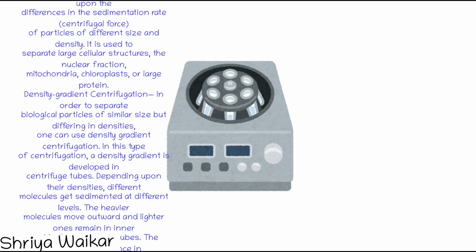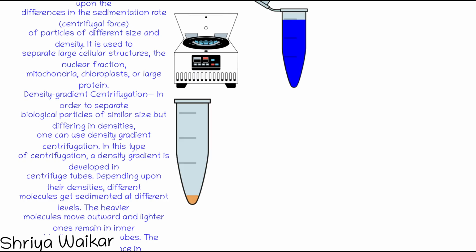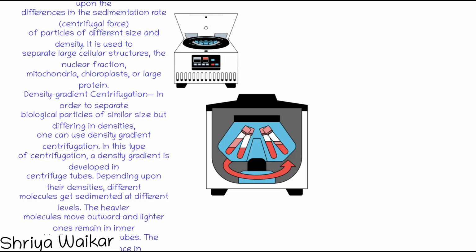Thus, what are the steps for centrifugation? Centrifugation is one such technique in which particles or molecules are separated based on density under the influence of gravitational force. We spin them in a solution around an axis at a high speed using centrifugal force. The equipment used is called a centrifuge, which is of different types depending on its use.